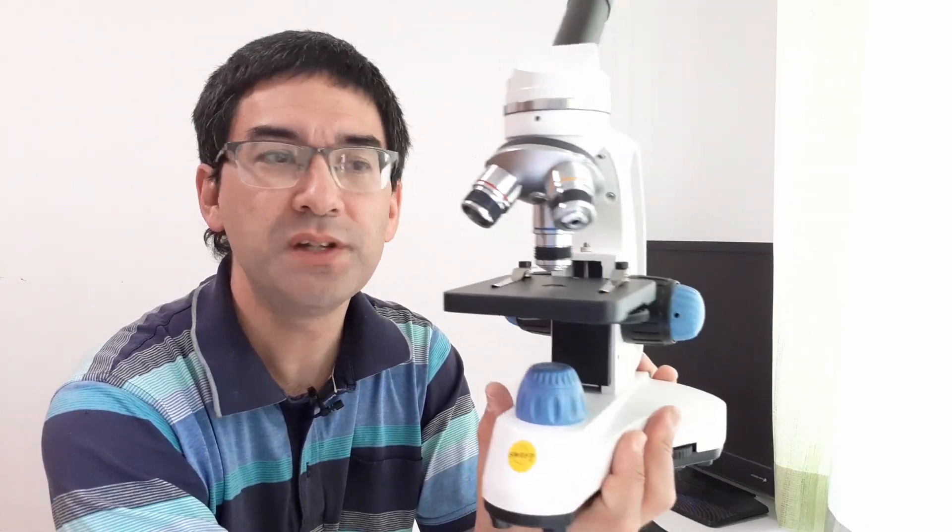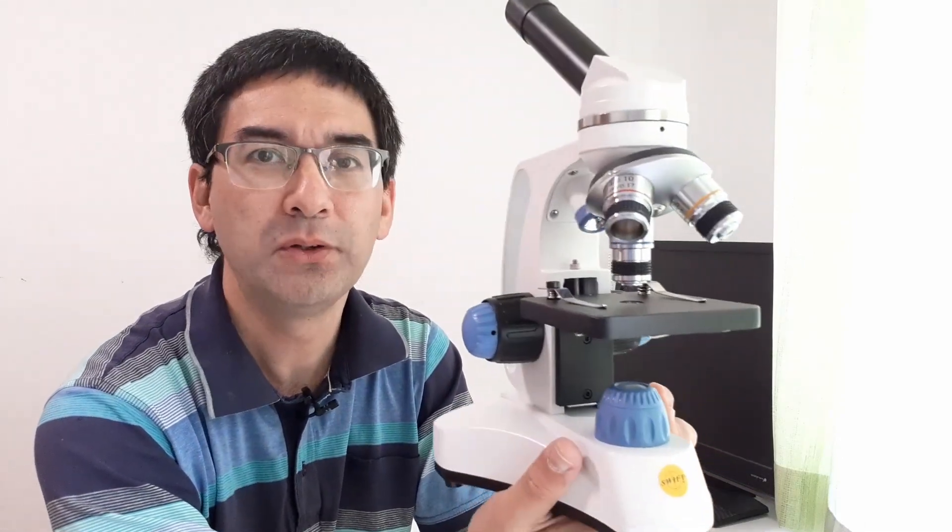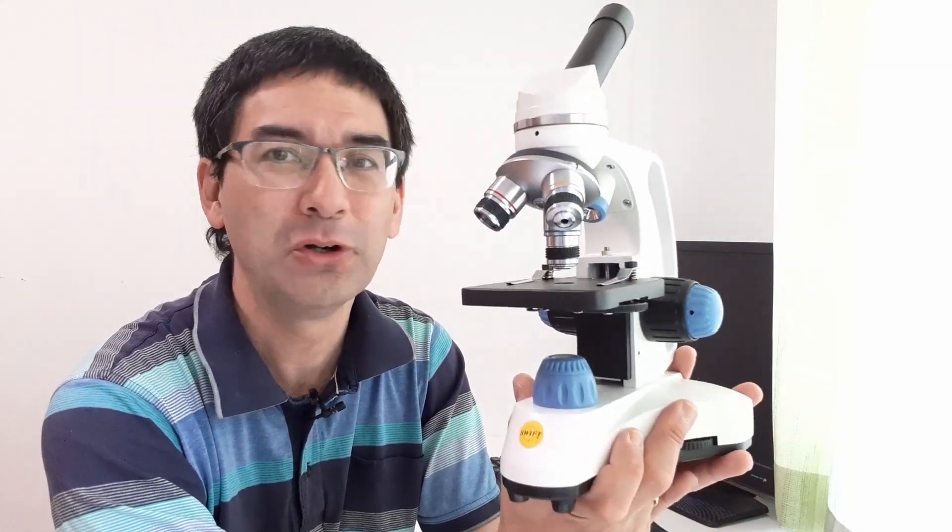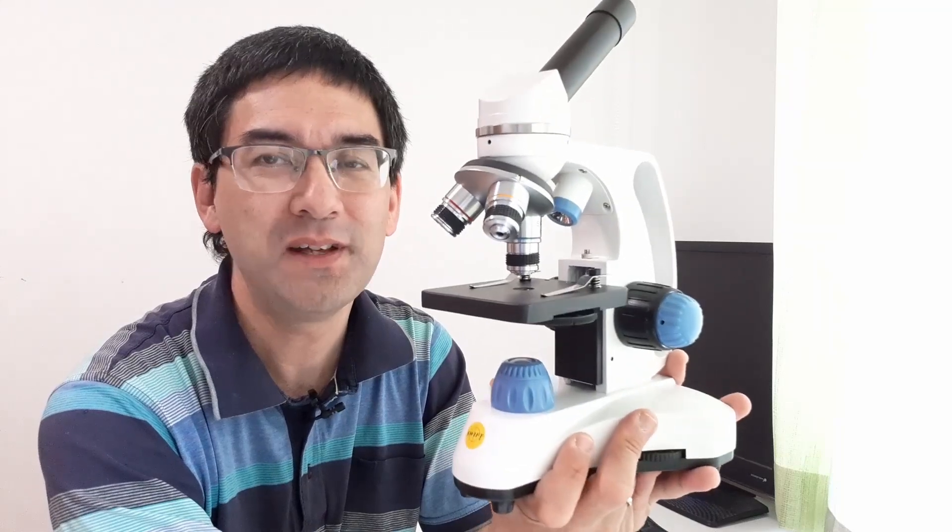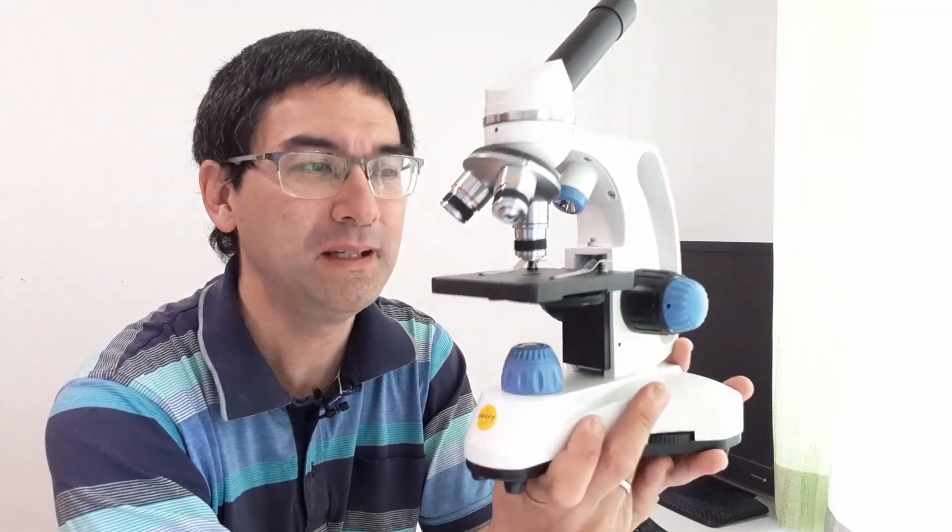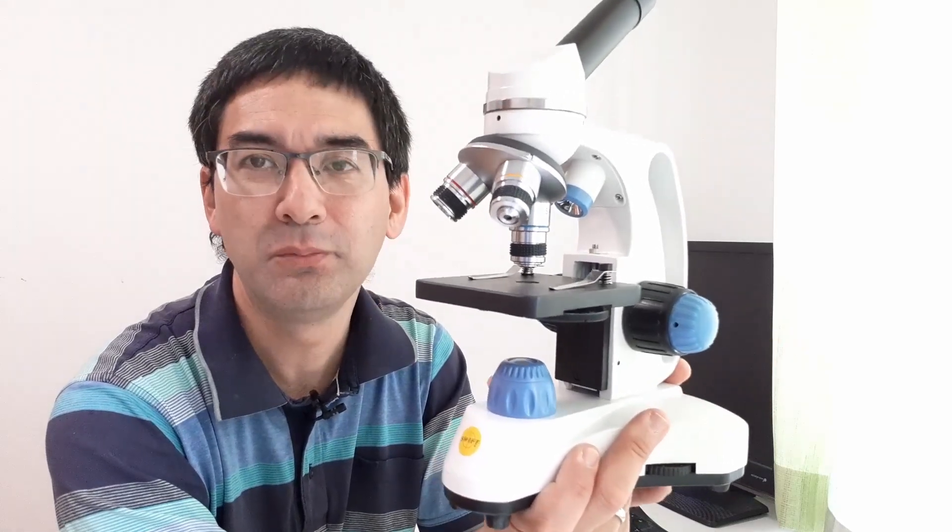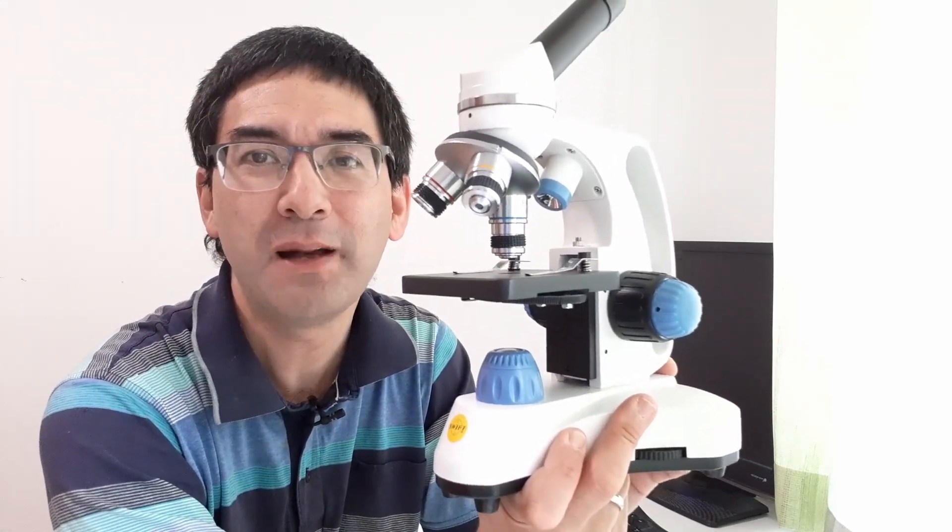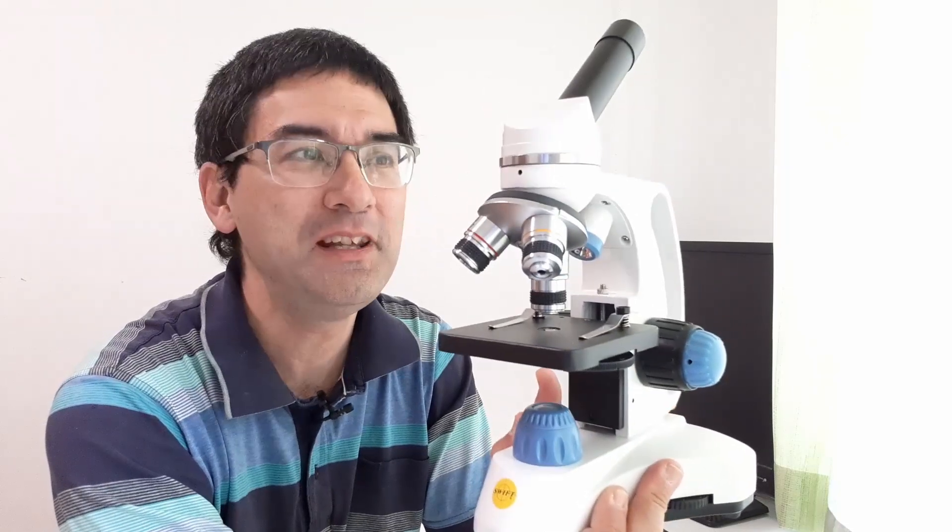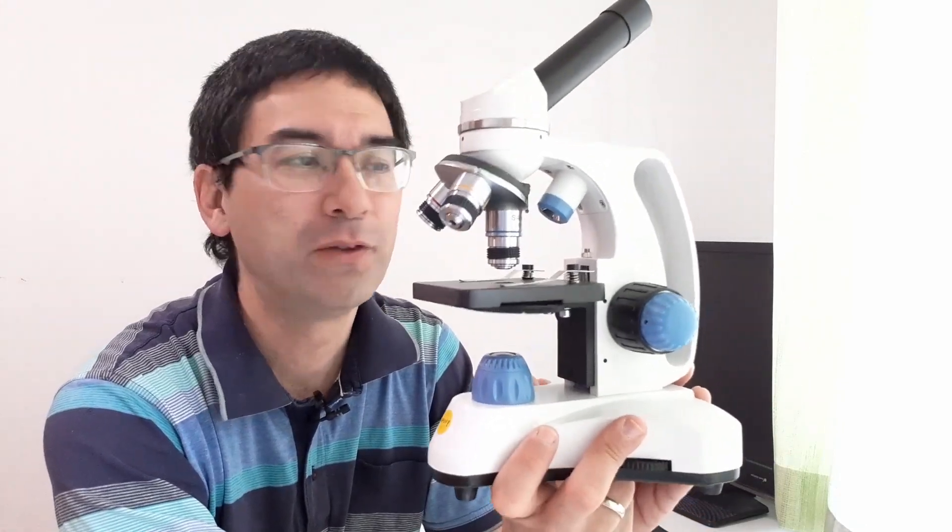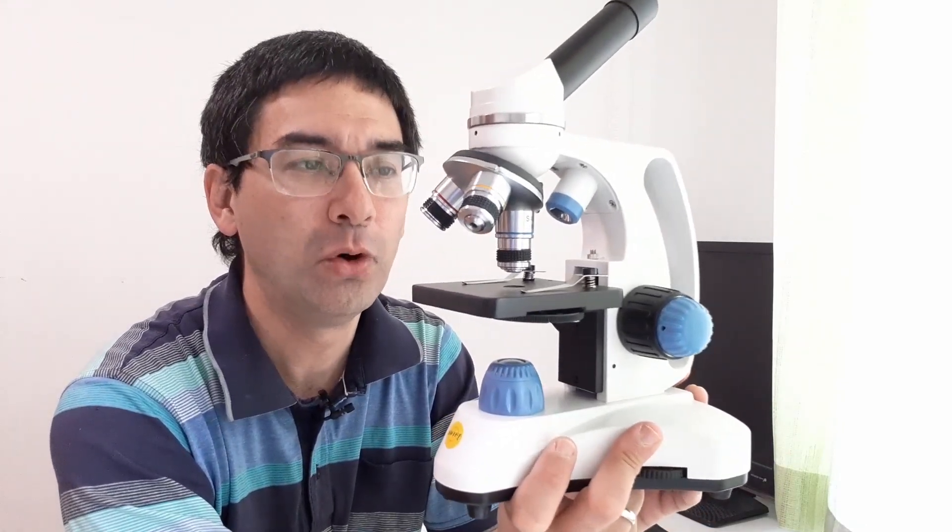Number two, anyone who is interested in picking up microscopy as a hobby but who does not know yet whether the hobby is something for him or her, and if you do not want to invest too much money at the beginning, then I would say buy yourself one of those. You will be able to join the community of amateur microscopists quite easily. You can take pictures, you can share them online if you want to. So it's a very low cost and straightforward way to start the hobby.